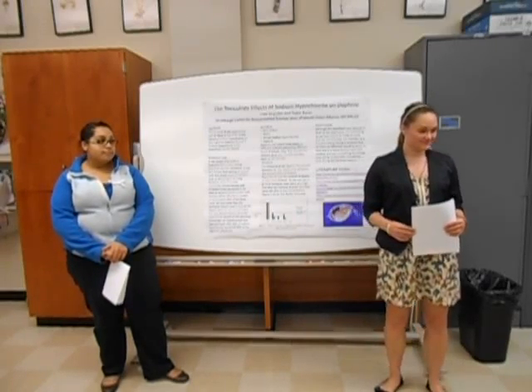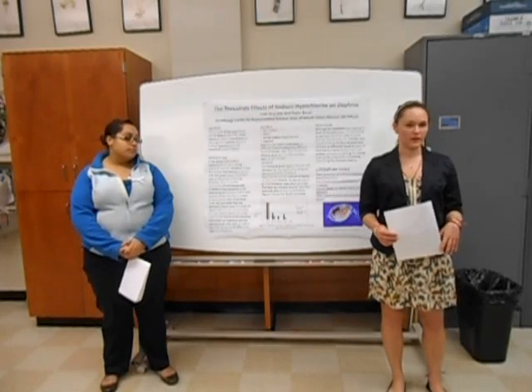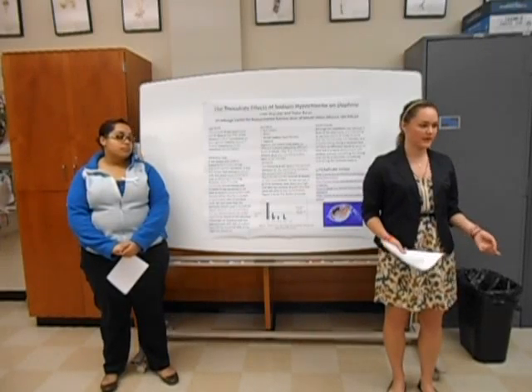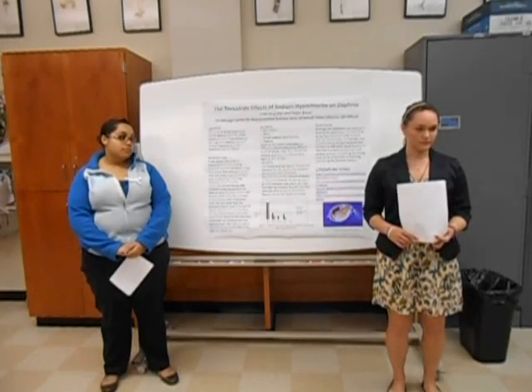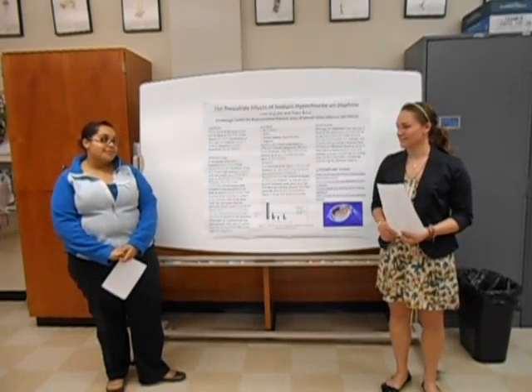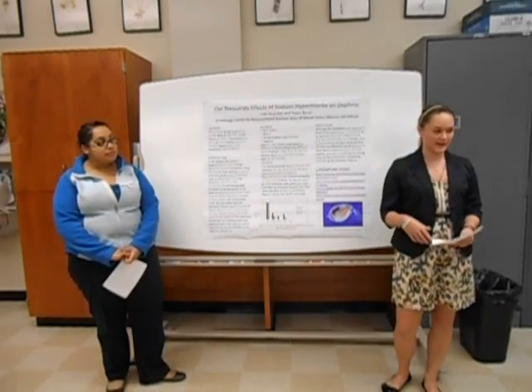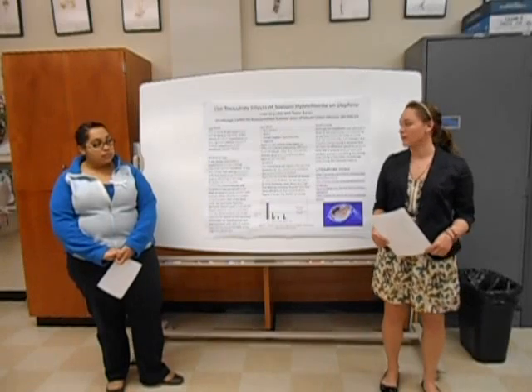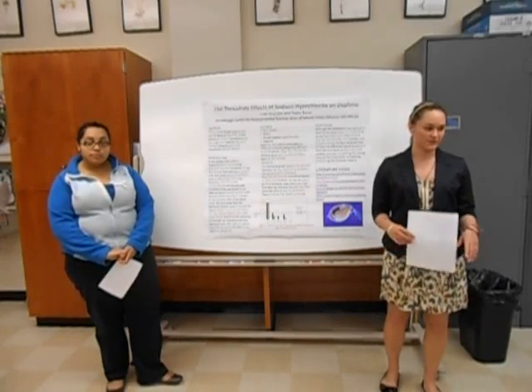So you think Daphnia are more or less susceptible than other aquatic organisms? I think they're more, especially since after we looked them up, they are used to detect that kind of stuff. So obviously they're looking for an organism that is easily manipulated by its environment. But maybe compared to the microworms, what would you say? Which would be more sensitive? Not that you did microworms, but. Yeah. I don't know. What do you think? I'm not sure which one would be more susceptible. And I feel as if the Daphnia were, because as soon as we added the bleach, they were dying, within seconds of that happening. And I don't know how relatable bleach is to some of the other contaminants, but it was such a low level compared to some of the other LC50s that were able to be measured.